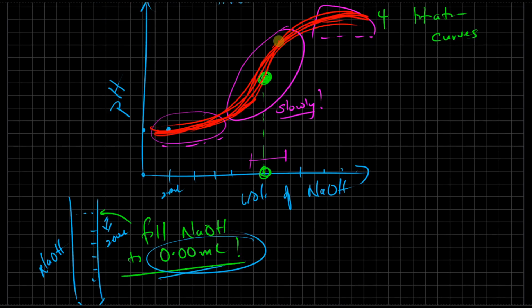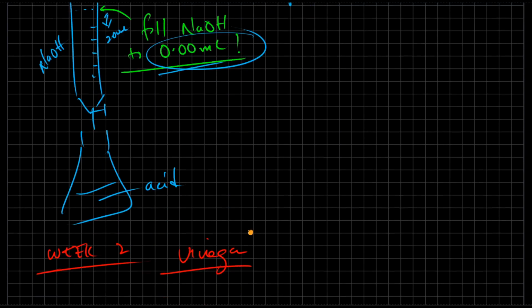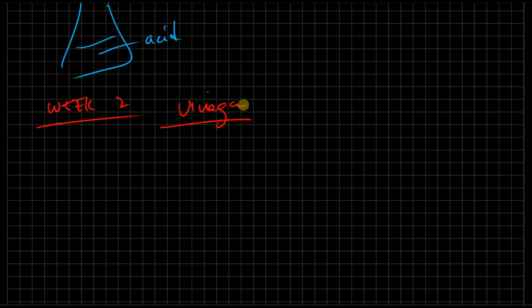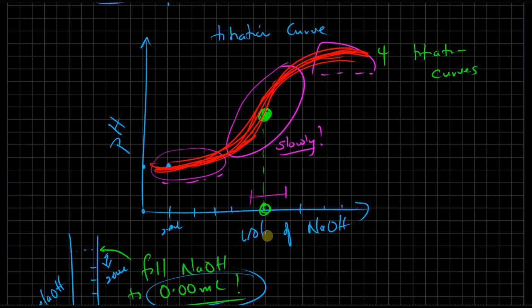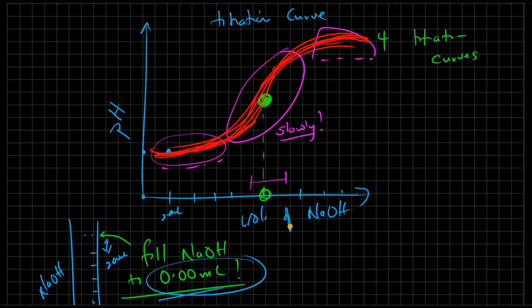Remember that you're going to be using a pH sensor, so make sure you calibrate your pH sensor with the appropriate buffer solutions. And for all of the waste in this lab, it's all either acetic acid, vinegar, or KHP. Each of these could be washed down in the sink with running water, so there are no difficulties there.